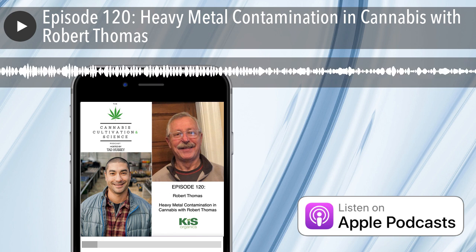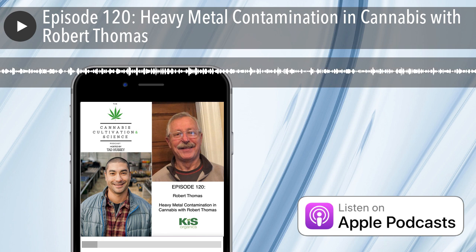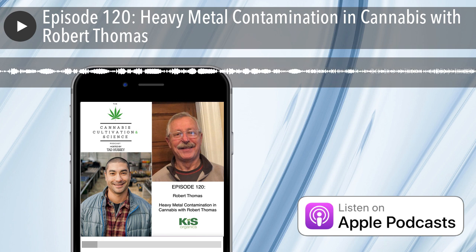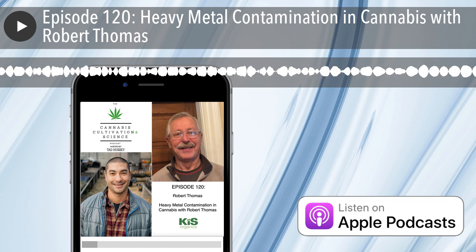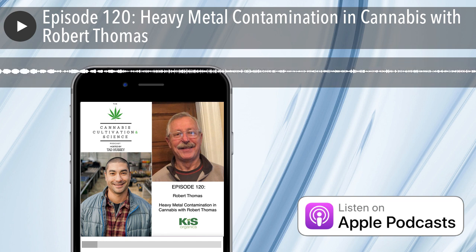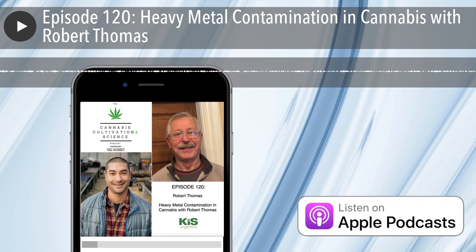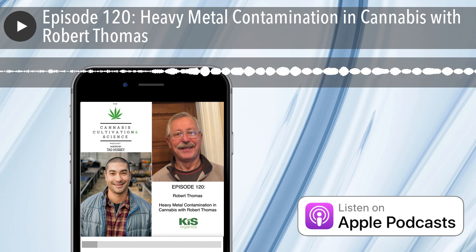So for those of us that are not familiar with ICP, I've never been in a lab, for example. What are some potential sources of contamination that I may not have considered? You mentioned being housed in a warehouse, but let's say someone does have a clean room. What could, for example, the clothing that someone was wearing, or potentially other things, could a prior sample potentially contaminate the next sample? What are some of the things that people should be looking for?